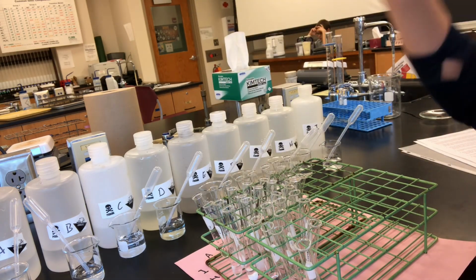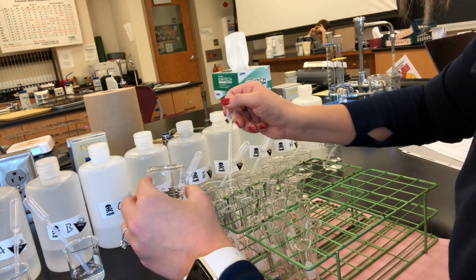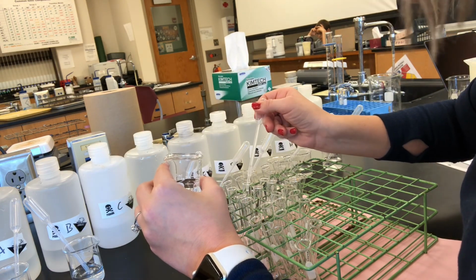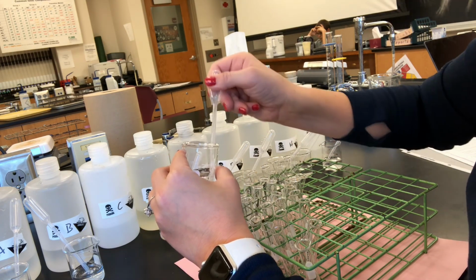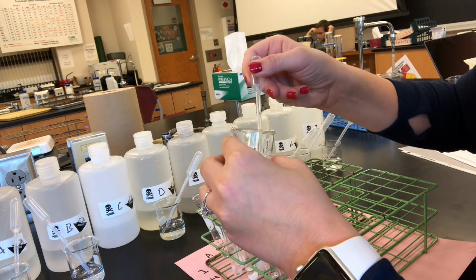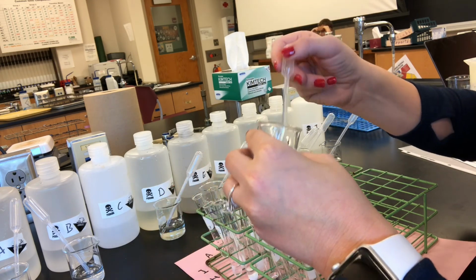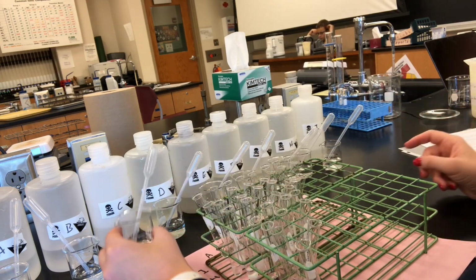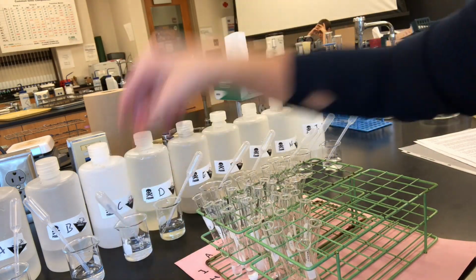All right, next up, I'll do C down the column. C, again, unknown C is clear, colorless.